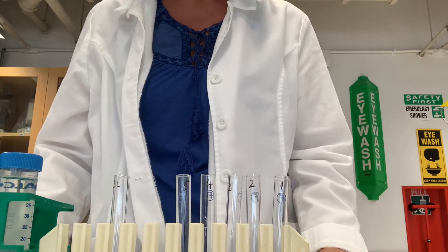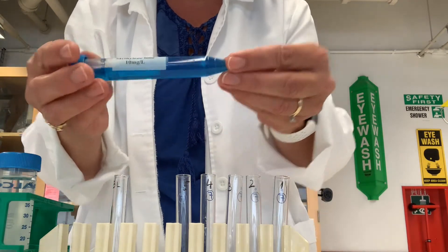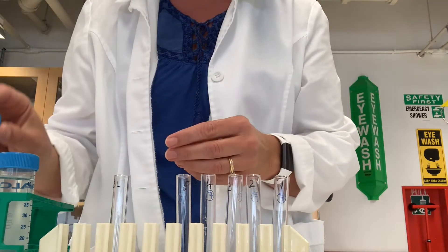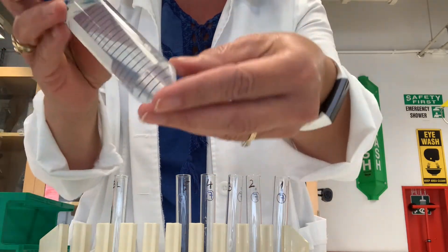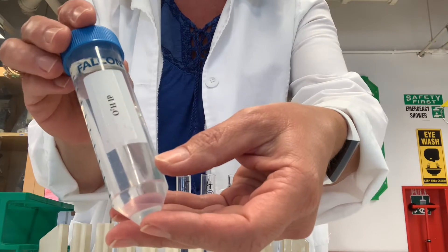Today you're going to be learning how to do a serial dilution of methylene blue. We have a stock solution of methylene blue, which is 10 milligrams per liter, and we also have deionized water, which is going to be used to make your dilutions.